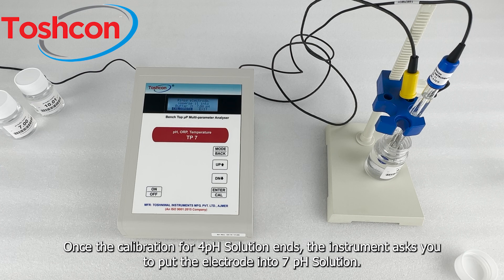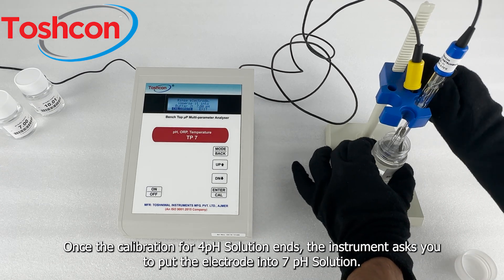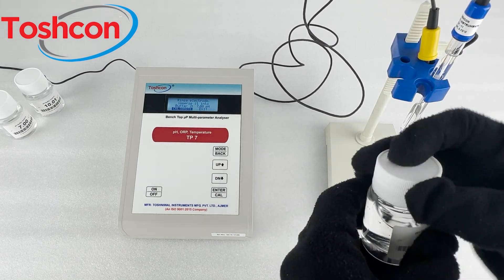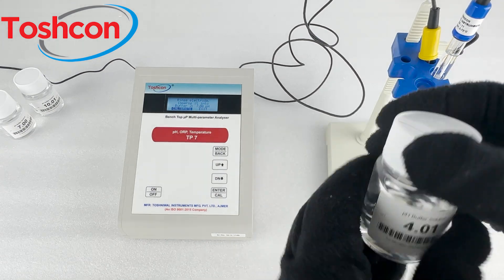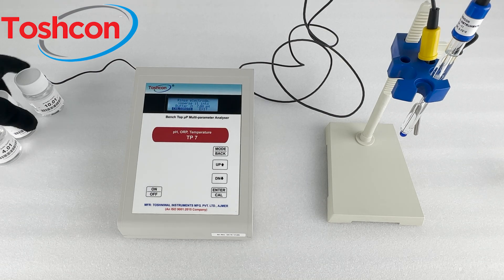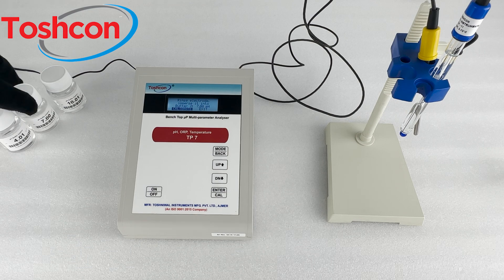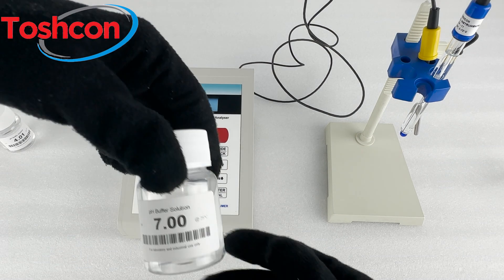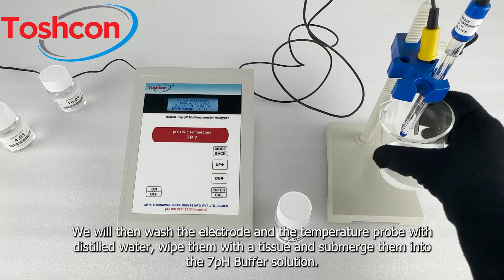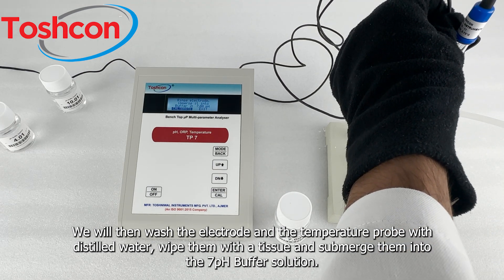Once the calibration for the 4 pH solution ends, the instrument asks you to put the electrode into the 7 pH solution. We will then wash the electrode and the temperature probe with distilled water, wipe them with a tissue, and submerge them into the 7 pH buffer solution.